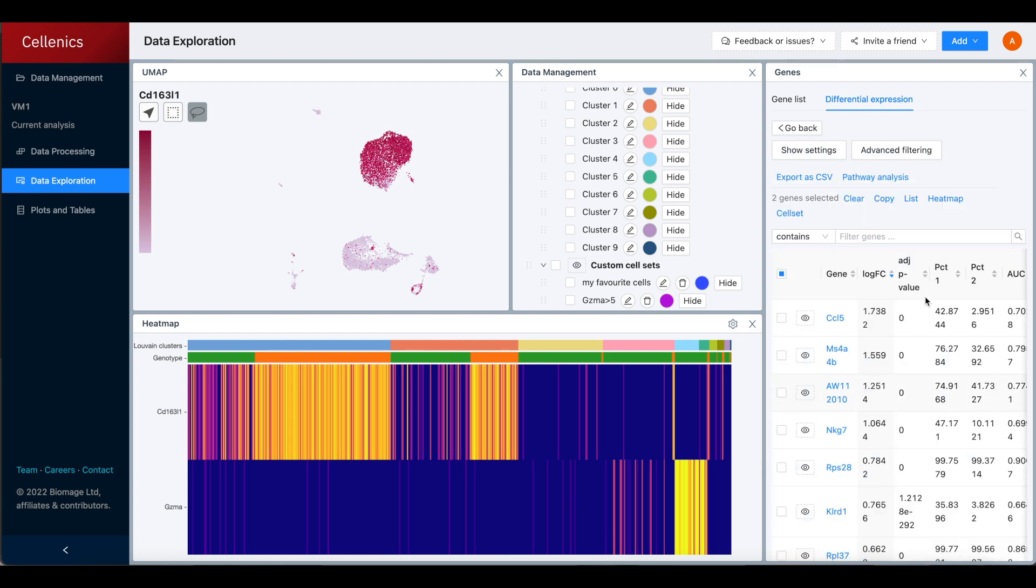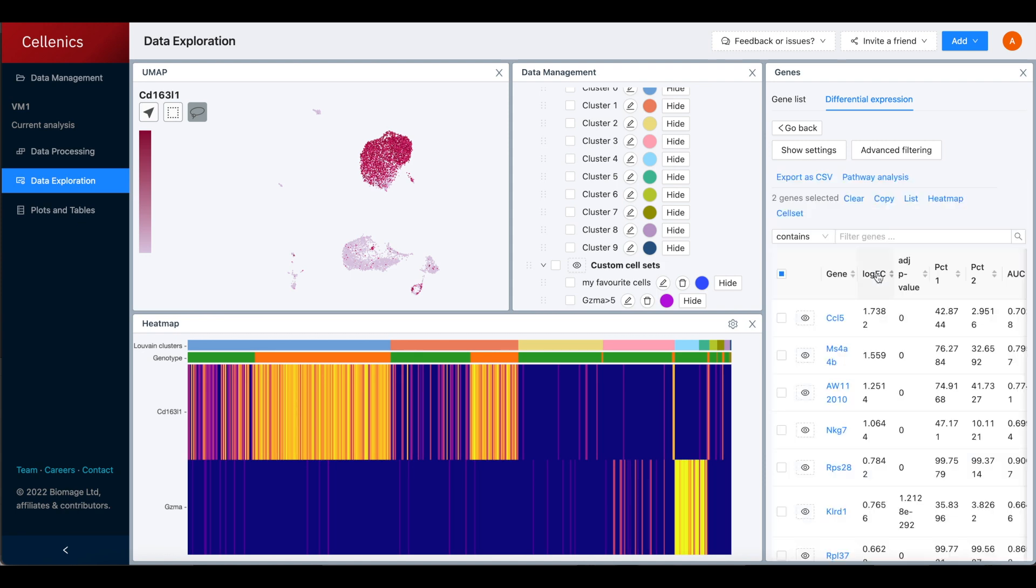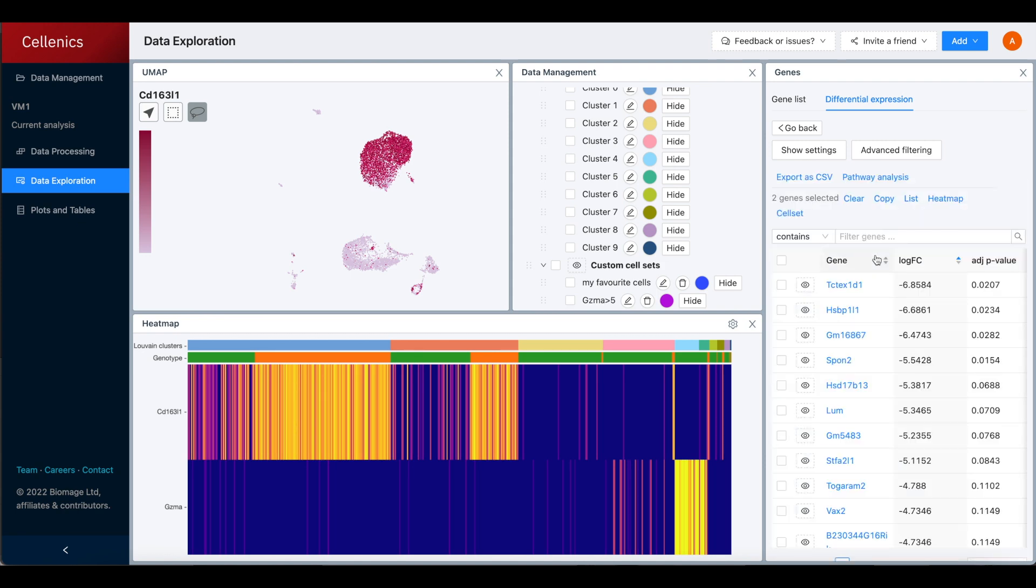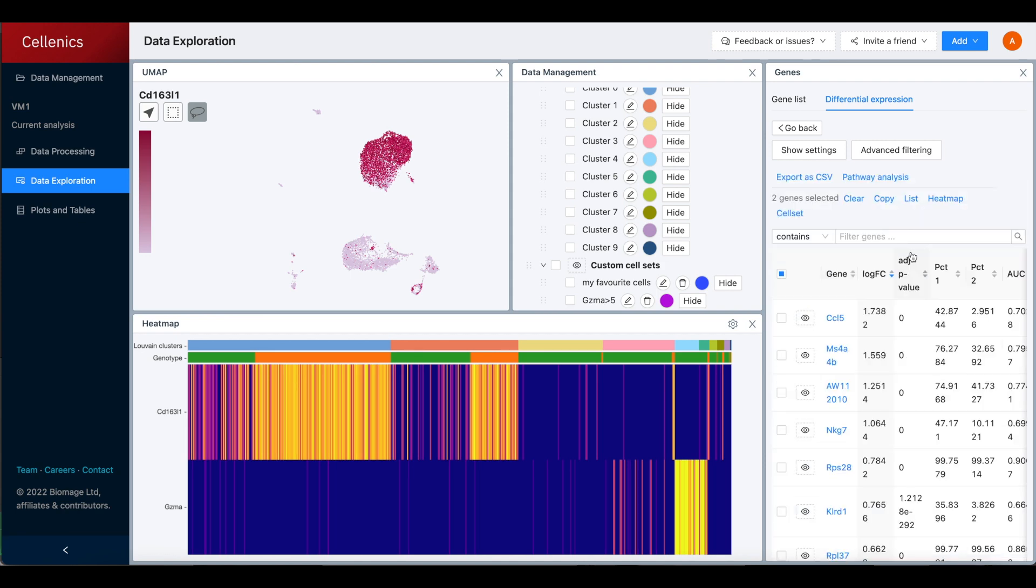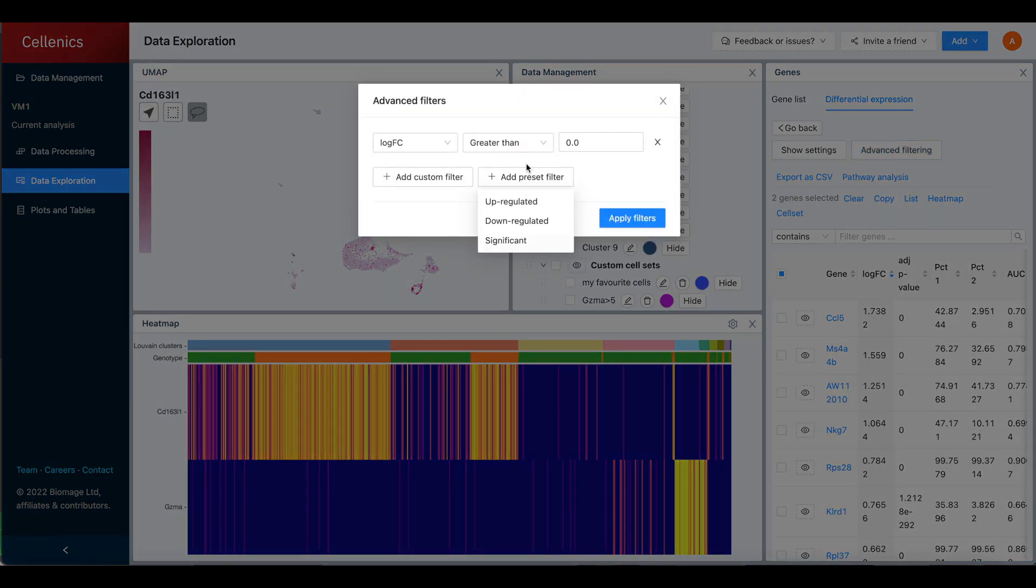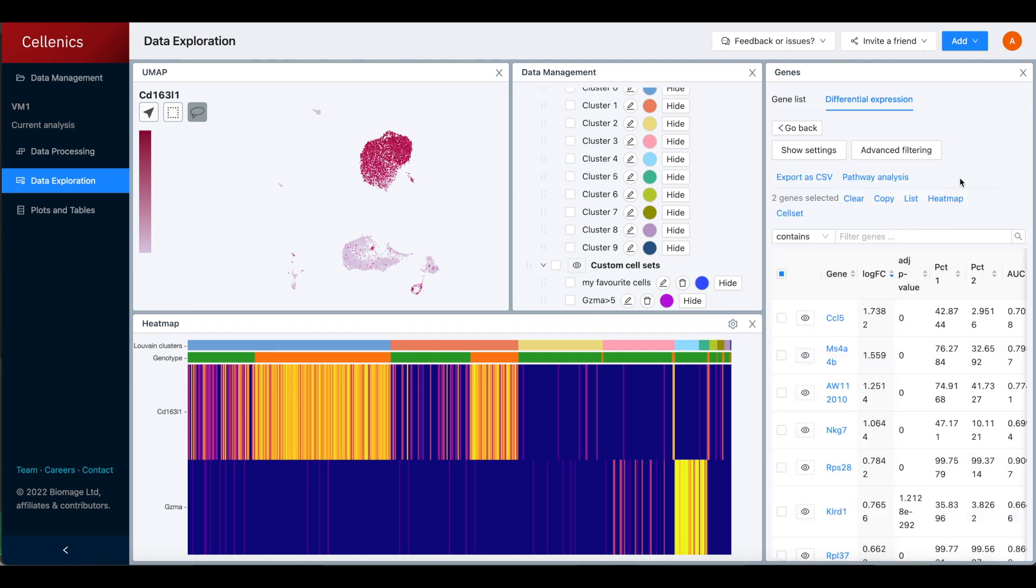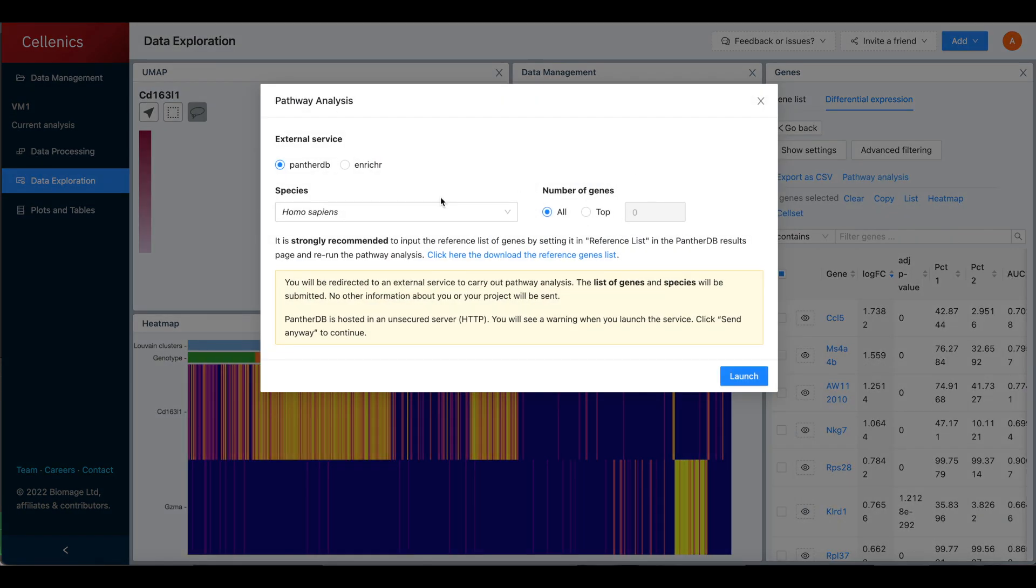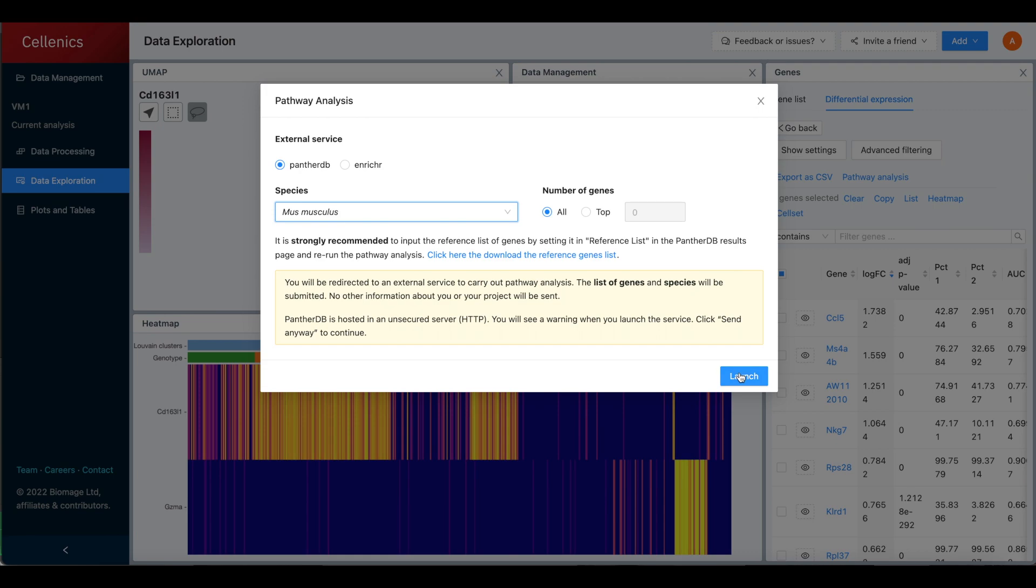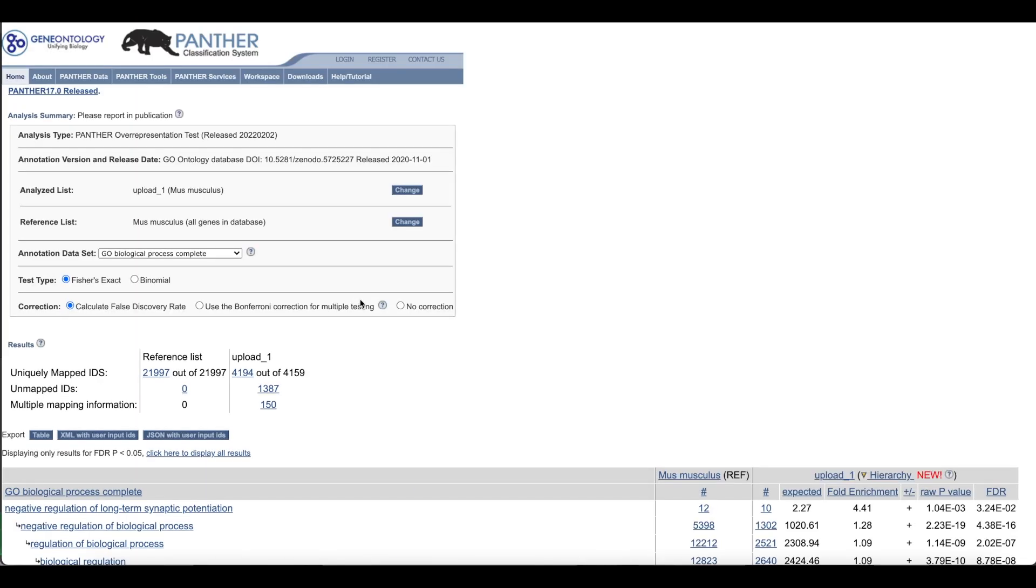The results are listed by descending order of log fold change and can be reordered in the table and filtered using the advanced filtering options, for example to select only the up or downregulated genes. Pathway analysis can also be performed on the filtered list of differentially expressed genes using PantherDB or Enrichr.